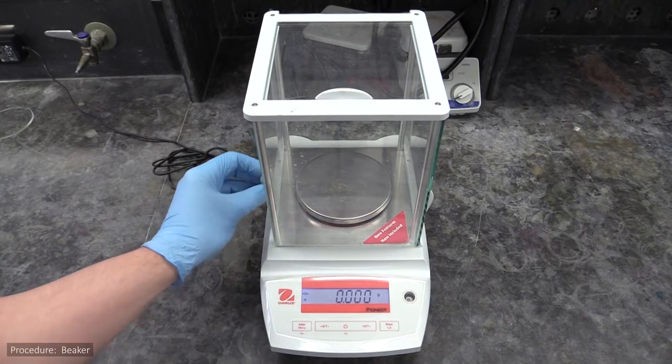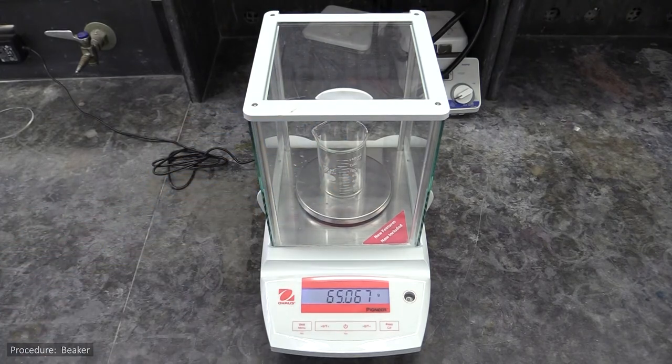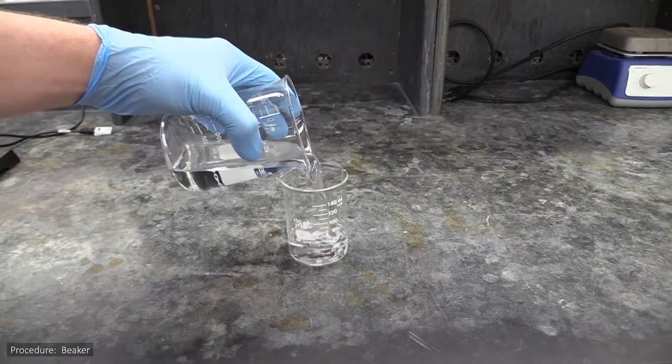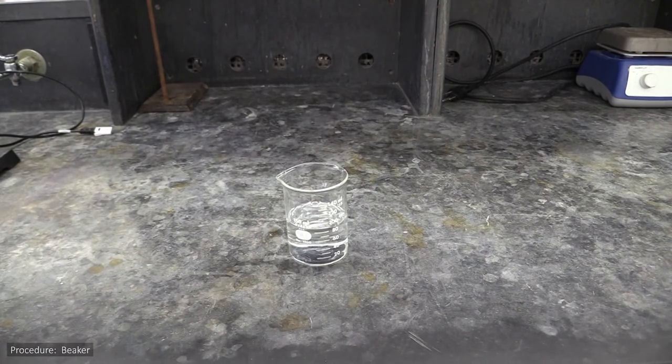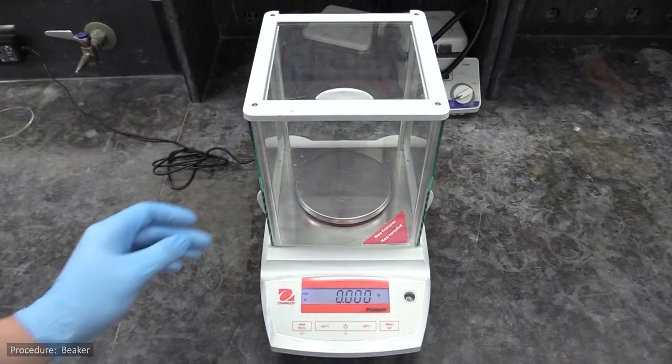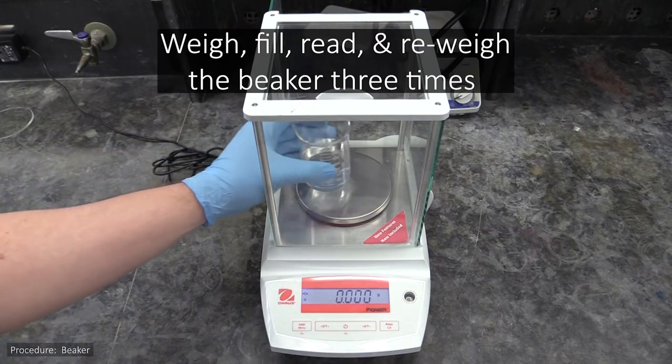Coming back to the beaker, you will begin your data collection by weighing it when dry to get its empty mass. You will then fill it about halfway with DI water and read the glassware's markings to determine how much water the markings say it contains. You will then re-weigh it with the water inside. To get all the data you need, you'll do these things three times.